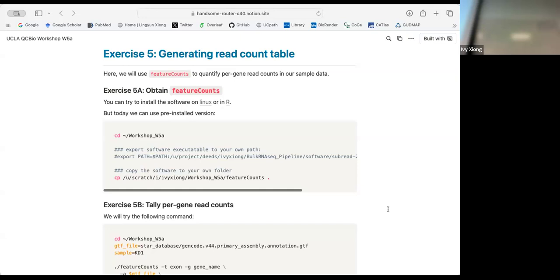So you don't need to wait for delivery. You can proceed to alignment with the KD1. So I run the cell, this is the one, or do I, yeah, you can copy this whole thing, I already have.